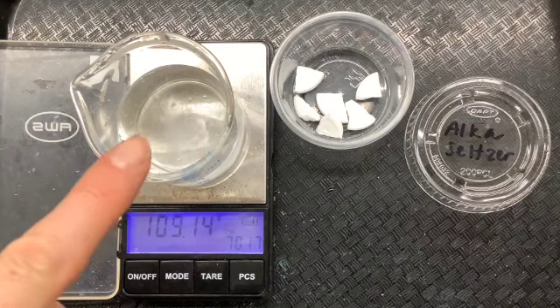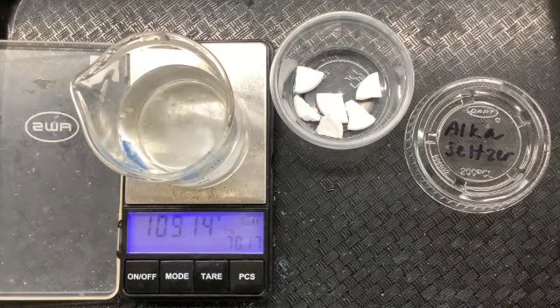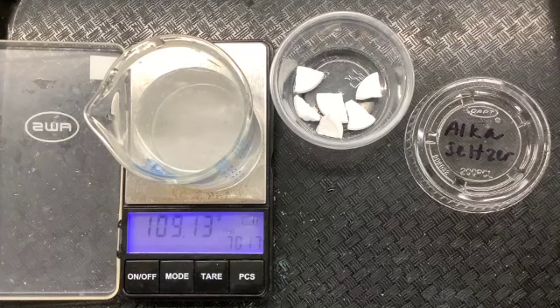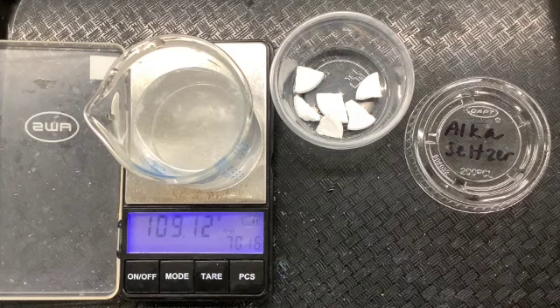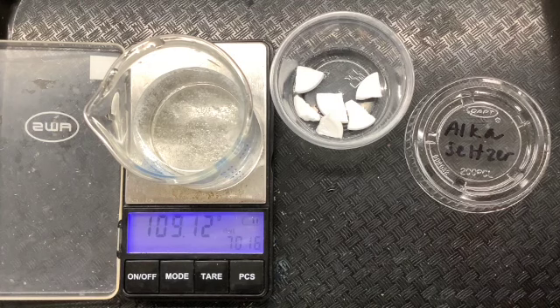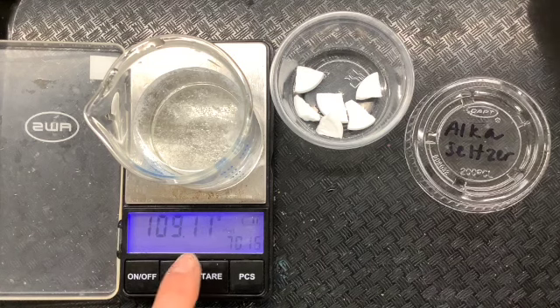Ooh, I can see lots of gas bubbles being produced right now. Okay, interesting. Oh, it went down. 109.12. So it looks like the tablet's pretty dissolved. So our actual total mass of the beaker plus the water plus the Alka-Seltzer is 109.12 grams. So, did your experiment follow the law of conservation of mass? If not, explain what could have caused the error. So, it decreased a little bit.